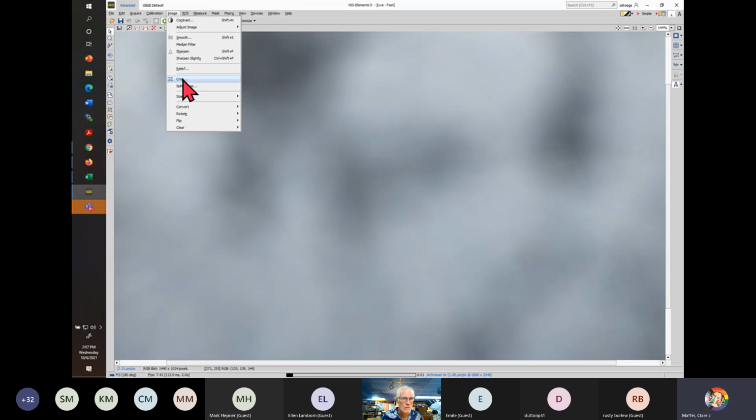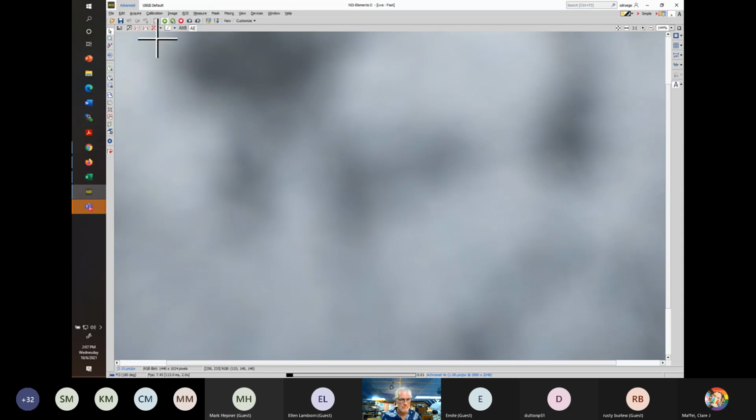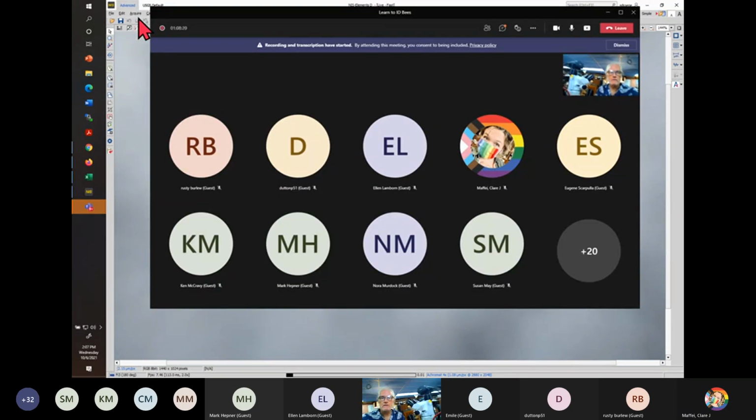I don't know. Are we mounted on a trinocular? Yeah. So I can show with the picture now. This is what it looks like there. And it just has a USB plug to my laptop and an electrical cord to the wall, and a sort of weird proprietary, potentially pain in the butt if you lose it, little hasp, which I can't pull out because it would turn the machine off. It's just like a little jump drive looking thing that you have to plug in that makes it work.